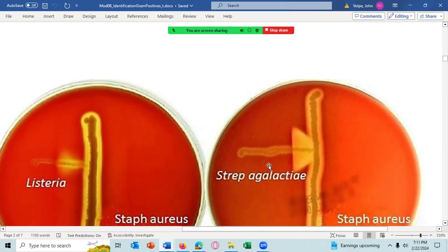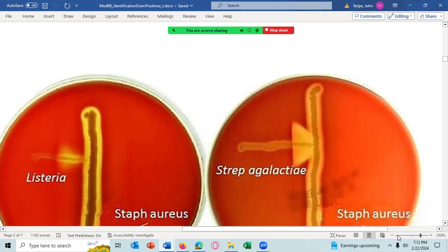And you'll notice that enhanced hemolysis takes the shape of an arrow. The same actually with the slight CAMP reaction. That's an arrow too. This, of course, is not enhanced because it's not near enough the Staphylococcus aureus, but that's the stick of the arrow and that's the arrowhead. I don't know why you get an arrowhead where there's more region of enhanced hemolysis out here than over here, but it is normal to see an arrowhead in the CAMP test when it's positive. Any question about any of that?